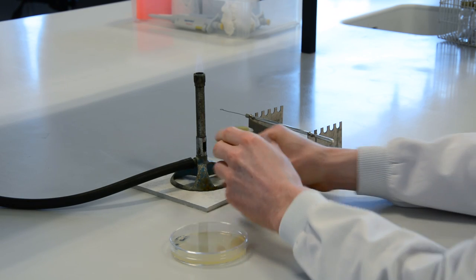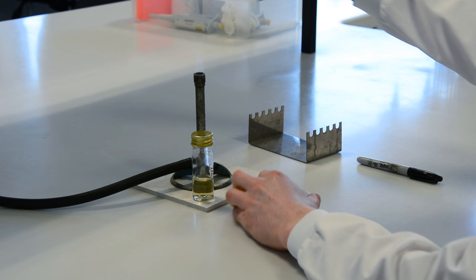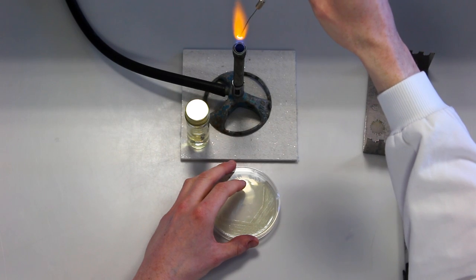A cool sterile loop is used to pick off a few single colonies from a pure culture grown on a solid medium.